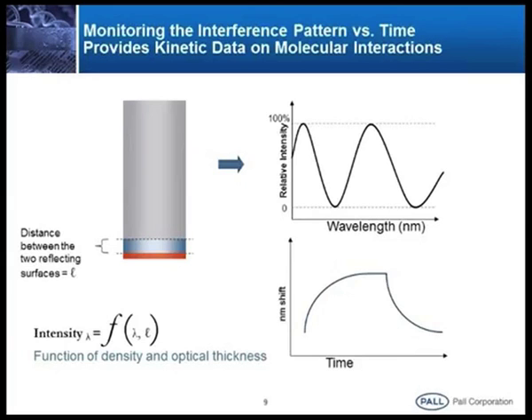So when we say kinetics, most people do label-based platforms, kinetic studies like ITC, and people do ELISA-based methods, but all the other methods only give affinity constants. Say suppose I can plot a sigmoid like this, at the midpoint, the IC50, what we call affinity. There are equations to calculate the affinity, but label-free platforms are the only instruments which give the on rate and the off rate values. None of the other instruments give the on rate and the off rate.